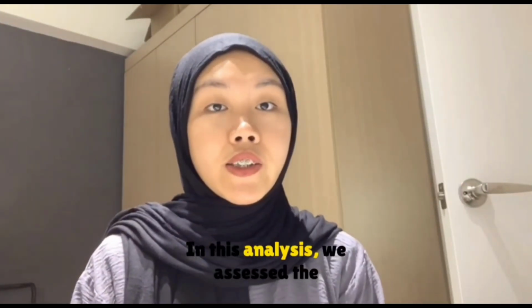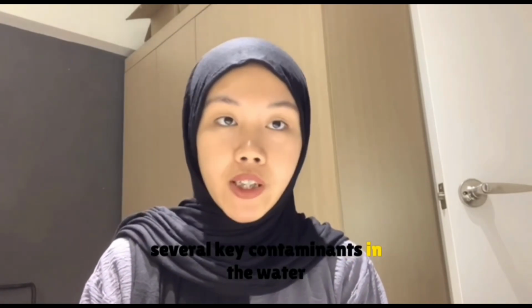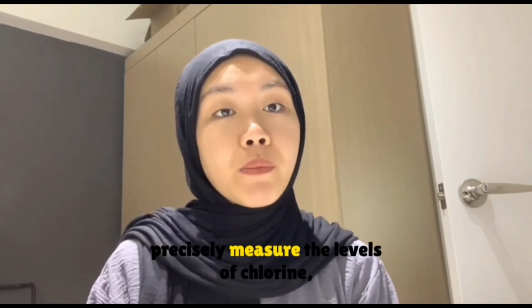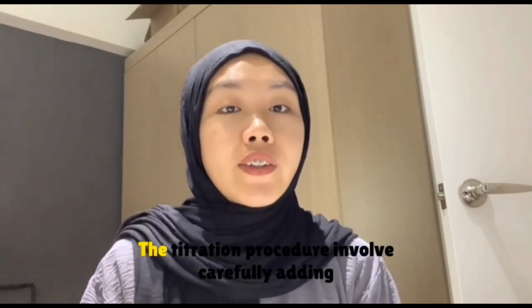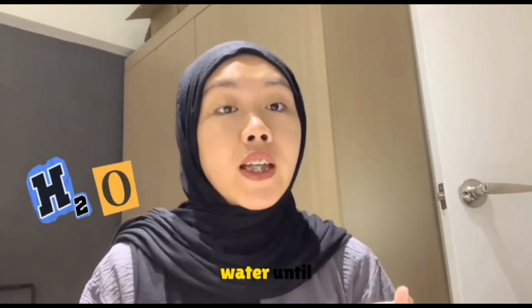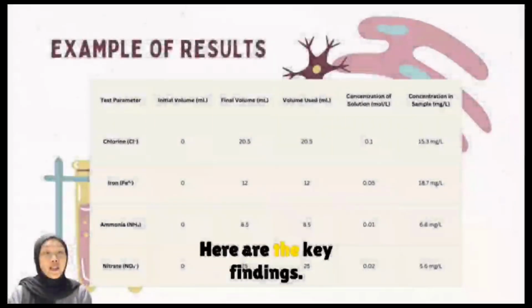In this analysis, we assessed the concentration of several key contaminants in the water sample. By performing volumetric titration, we were able to precisely measure the levels of chlorine, iron, ammonia, and nitrate. The titration procedure involved carefully adding a standard solution to a known volume of water until the reaction reached its endpoint, indicated by a color change. Here are the key findings.